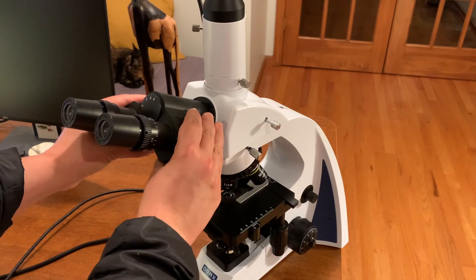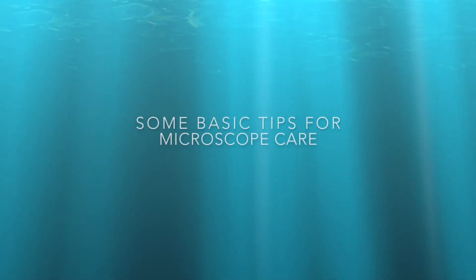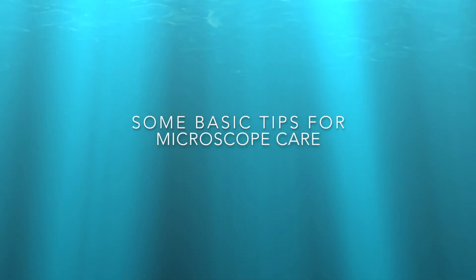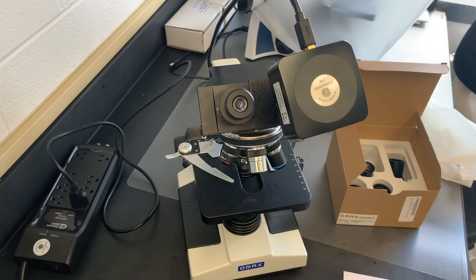As you've probably already discovered, the eyepieces can also be adjusted to the width of your eyes. Good general care with the microscope is to always make sure that it's switched off when not in use.